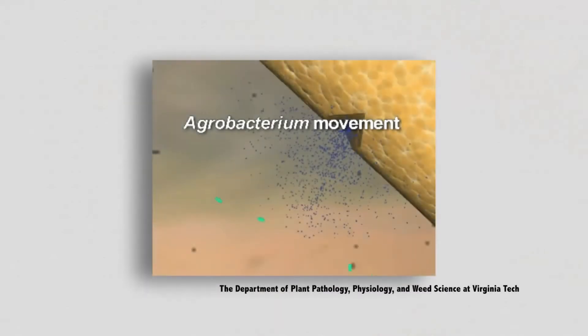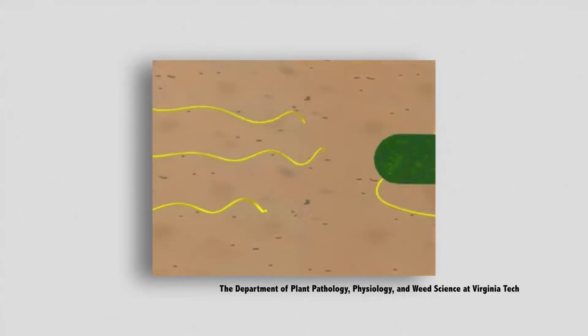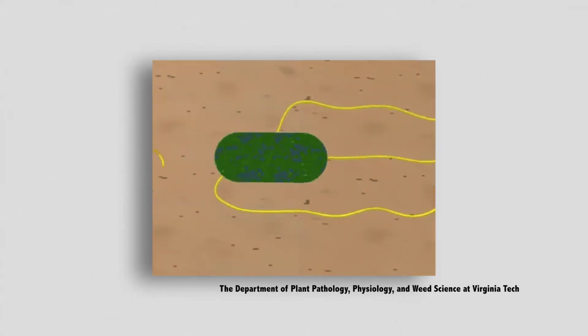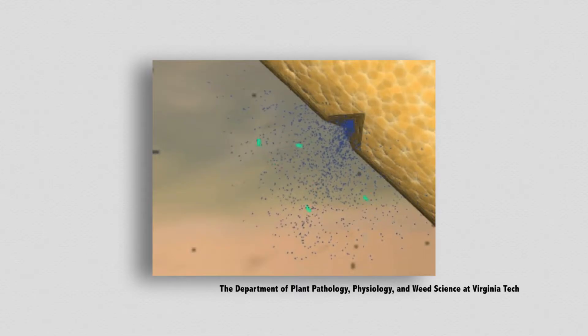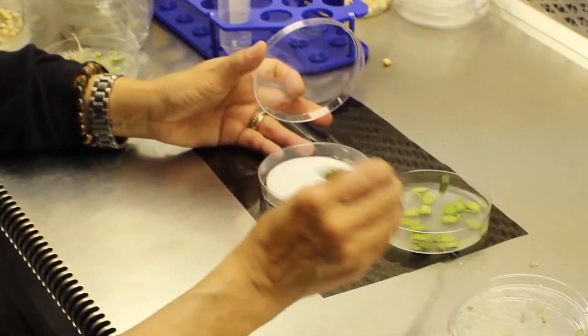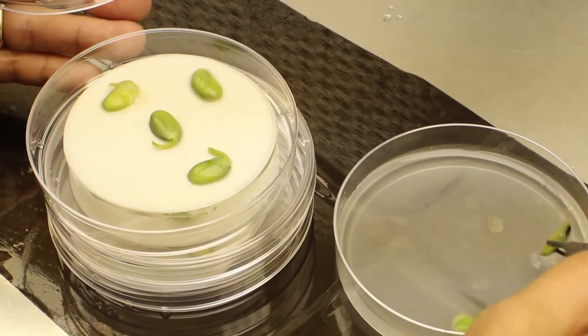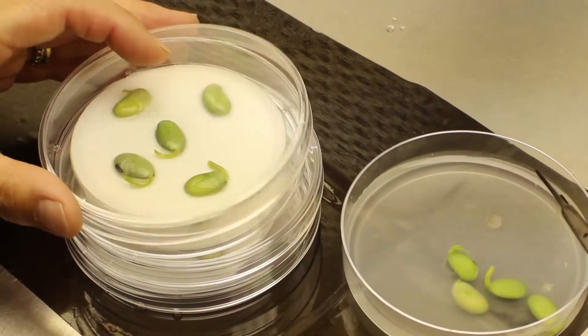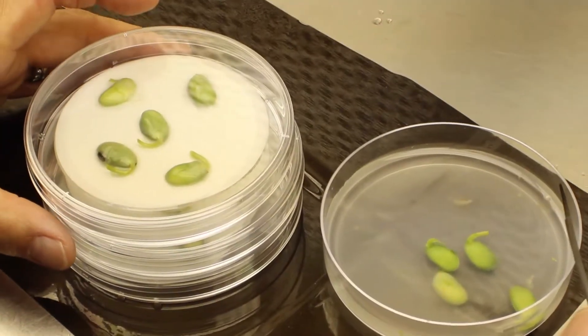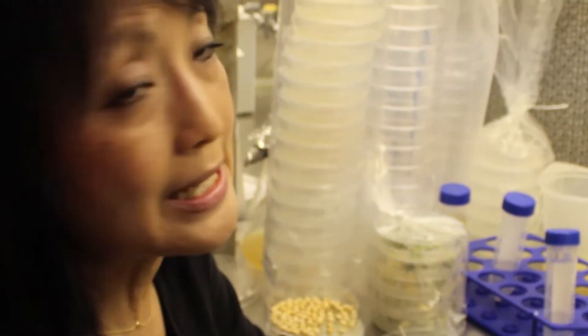The bacteria has started to attach to the cotyledons. The agrobacteria is attracted by compounds generated from wounded plant cells. We move the cotyledons wounded side down in contact with the filter paper, which contains the co-culture media.